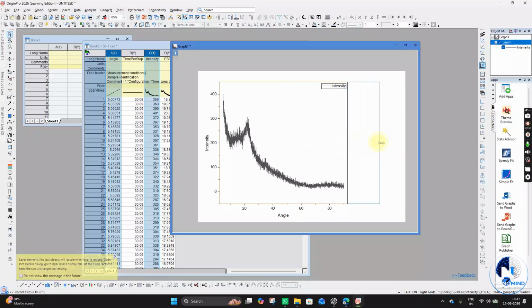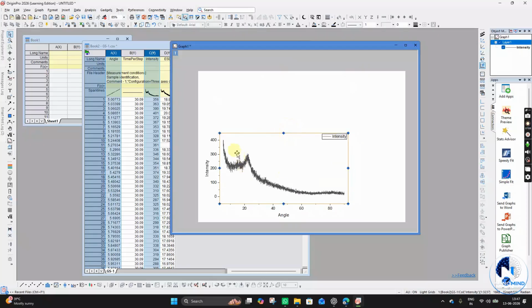If it is a square shaped white background, you must reduce the height of the plot downward so your plot becomes a little bit rectangular. Follow these rectangular shaped plots only for the entire article. This is the most attractive one.